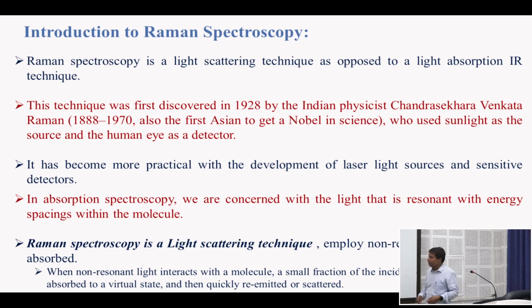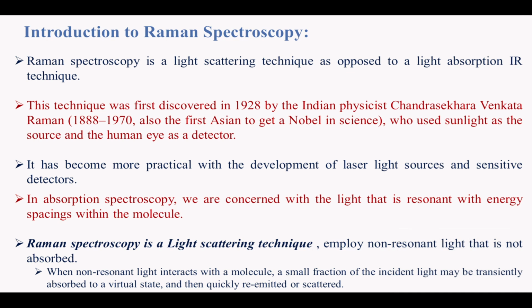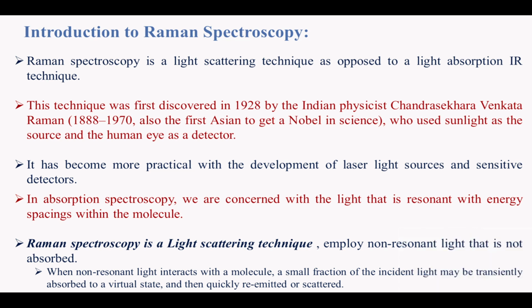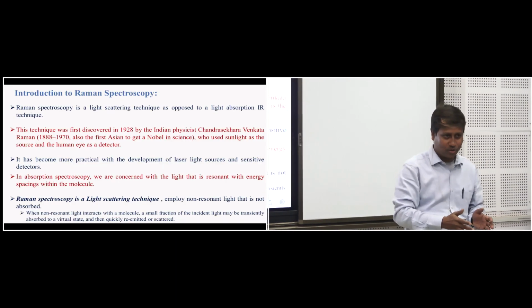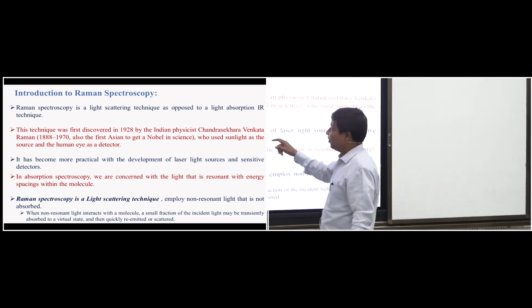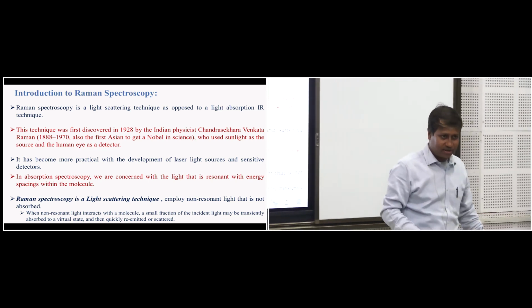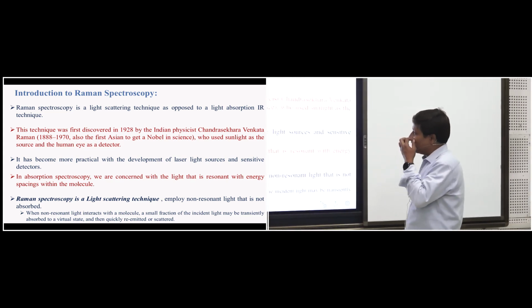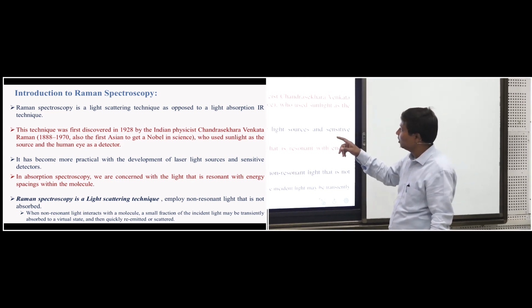Now, the introduction of Raman. Raman spectroscopy is not like IR spectroscopy or microwave spectroscopy. In that sense it is quite different. It is a light scattering spectroscopy. Light is scattered by the molecule, not absorbed by the molecule. And he first reported this spectroscopy result in 1928, almost 100 years ago, no?